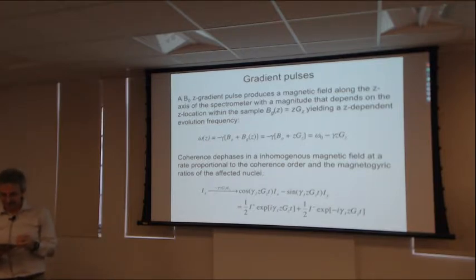And what happens pictorially, I keep meaning to make a better picture, but we start, for example, with Ix magnetization, and before the pulse, if we think about magnetization along the z-axis, every little sub-ensemble along z is pointing in the same direction. Right?